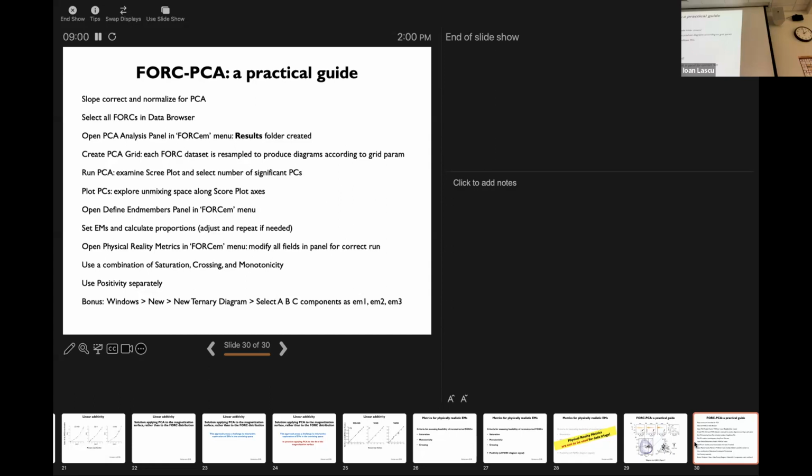If you're operating in an unmixing space defined by 2 principal components, having an additional end member, a 4th or a 5th, I think over-characterizes. You don't need it unless you go to higher PC space. This multidimensional space is sometimes hard to visualize. Well, it's always hard to visualize beyond 3D. You need the number of PC components plus 1 to define a region in that space.